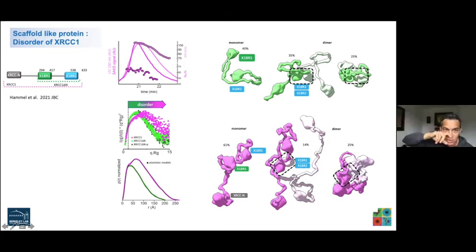So usually what we're seeing is people are pushing the limits of that because they want to go to larger things, right? And these columns don't necessarily support that. But what we have seen is if you connect two of them together, so two 800 series columns or two SuperDex columns, you increase the separation resolution pretty significantly for large things. The caveat to that is that the run is going to take about 3 to 4 times longer because the back pressure goes up and you have to run at a lower flow rate.